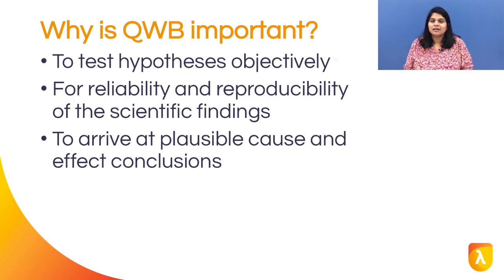Western blotting technique may help in testing hypotheses objectively under the assumption that the experimental framework is sound and optimized. Western blotting, when done reliably and reproducibly, is a quantitative approach to study changes in protein expression and can therefore help in arriving at plausible cause and effect conclusions.